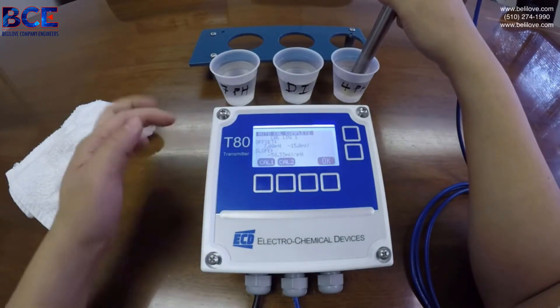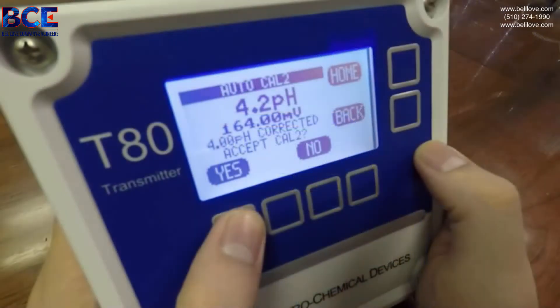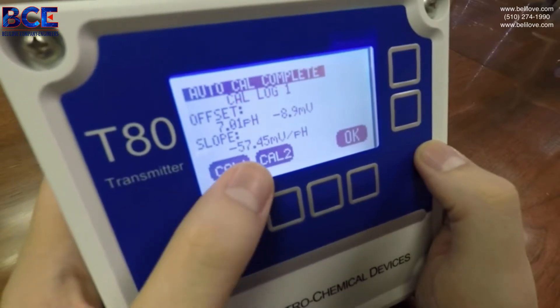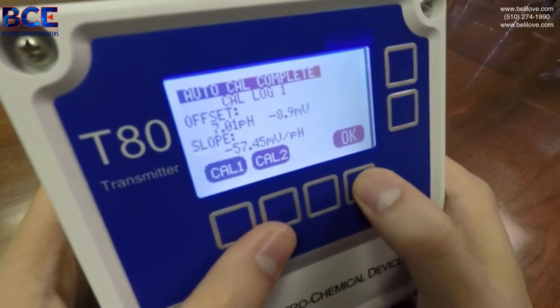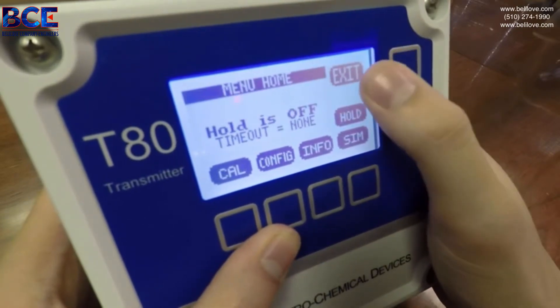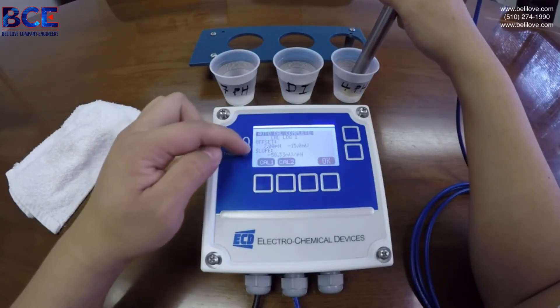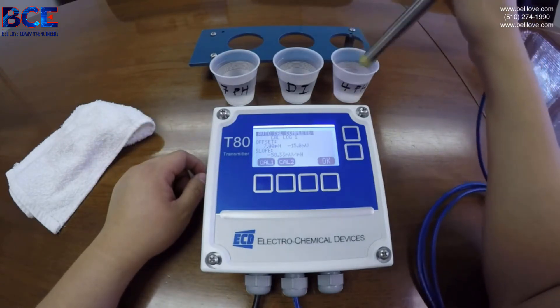You will now enter into your slope screen. A good working slope is around 55 to 60 millivolts per pH. Because this reads 58.33 millivolts per pH, this is now a good working sensor.